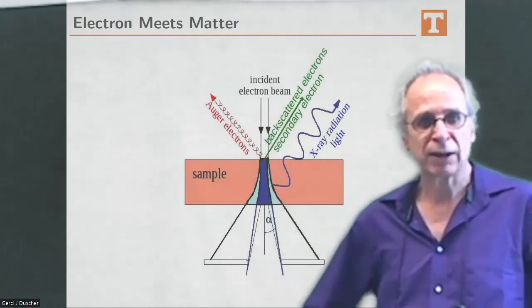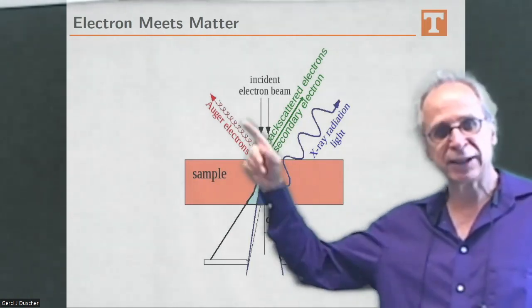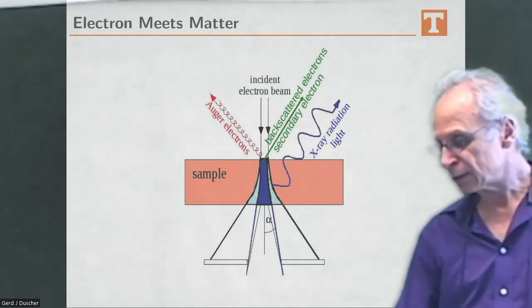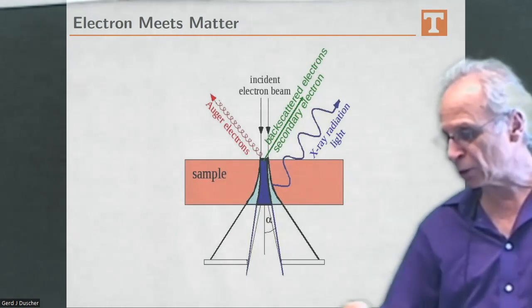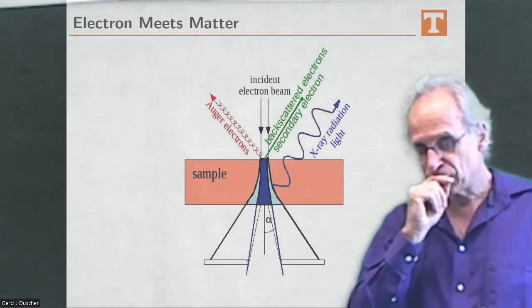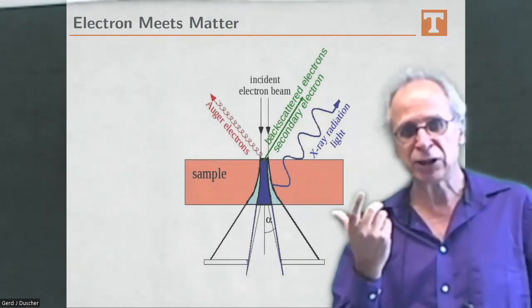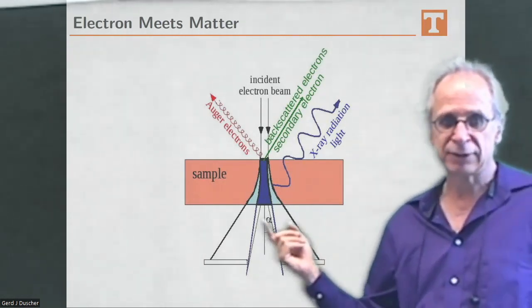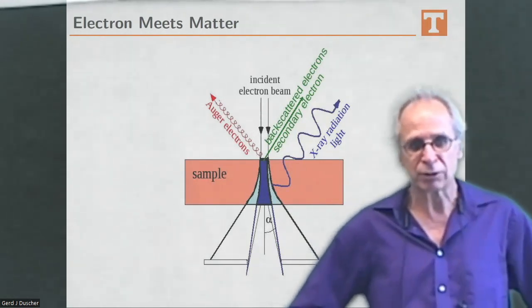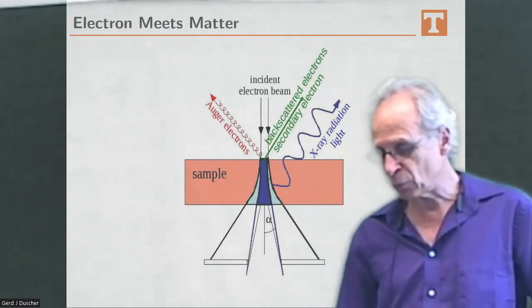The backscattered electrons are an elastic effect, while the secondary electrons are an inelastic effect. So if we have that, then the key thing for our information are actually the angles. The angles in the scanning transmission electron microscope are key ingredients, and we will talk more about that.